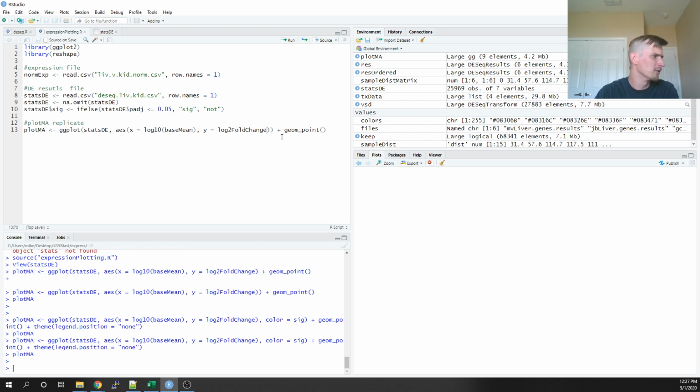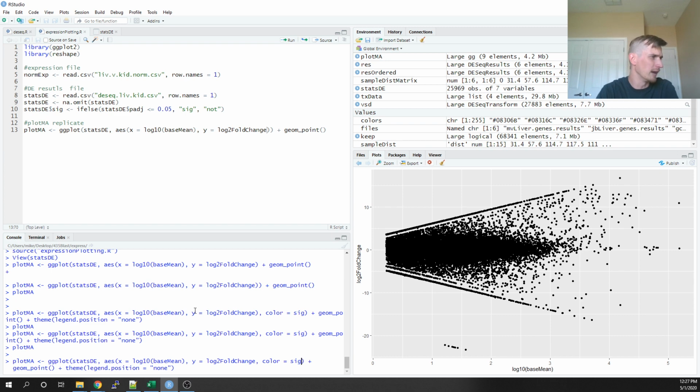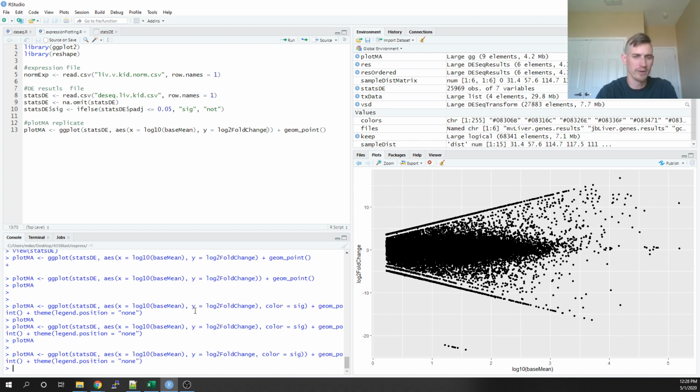Actually, I think I know. It's always something so simple as a parenthesis in the wrong place. That's all it takes. It's just a parenthesis in the wrong place, and it just won't work. Let's try that one more time.